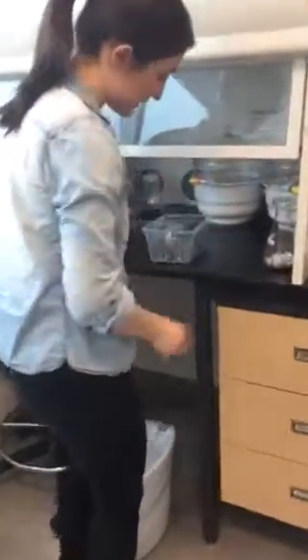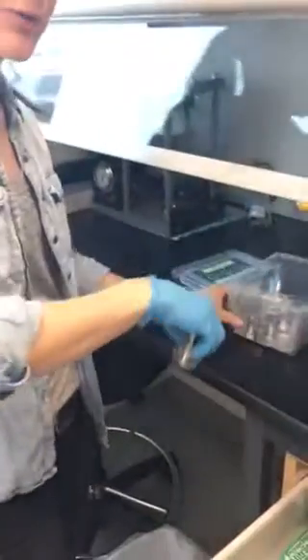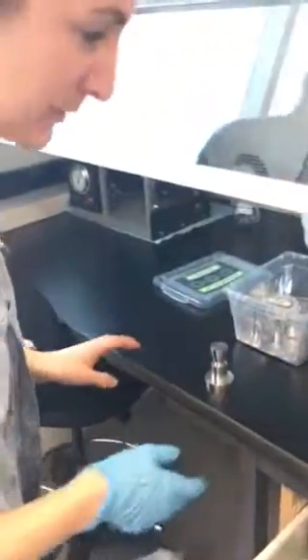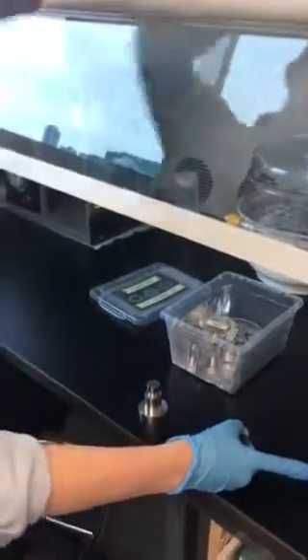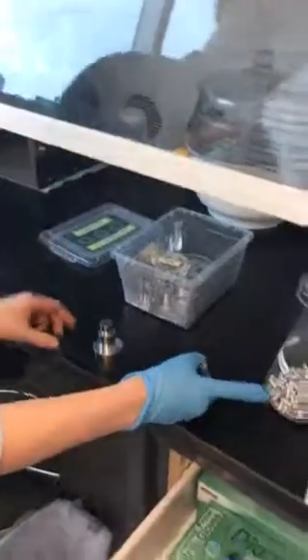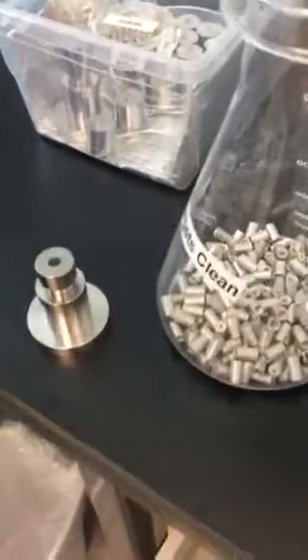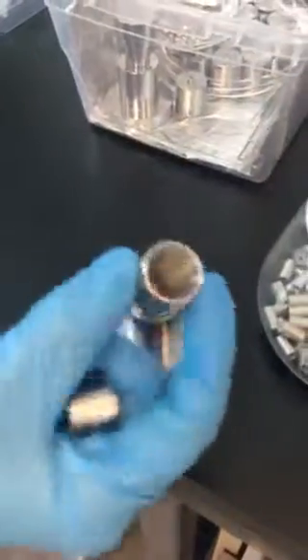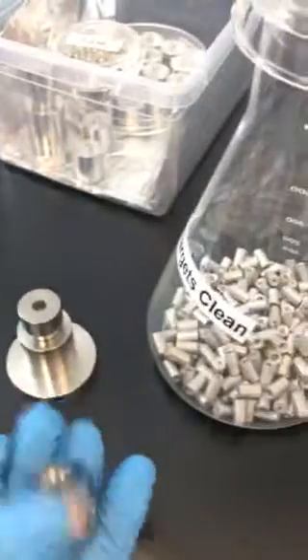And then what we do is use these custom pressing modules. All of this equipment was designed and built in-house, which is pretty amazing that we have that capability. So basically what we do is take one of these aluminum targets and put it into here, and then using one of these funnels, we basically funnel the sample in and then put the cap back on.